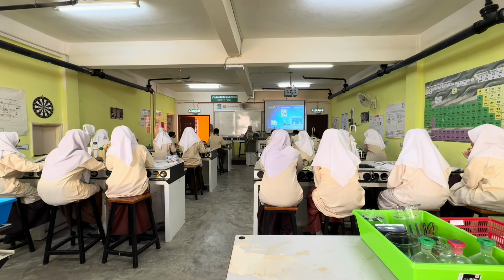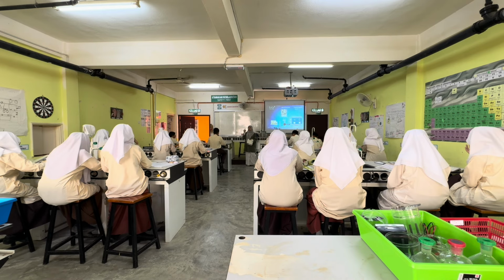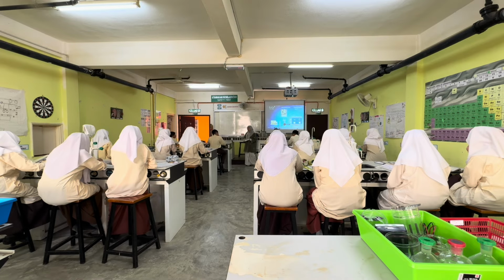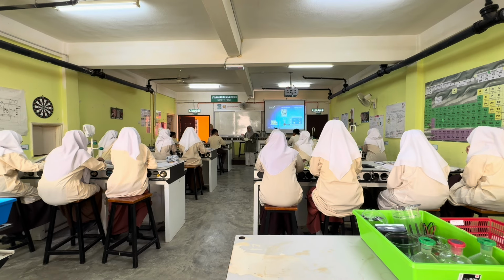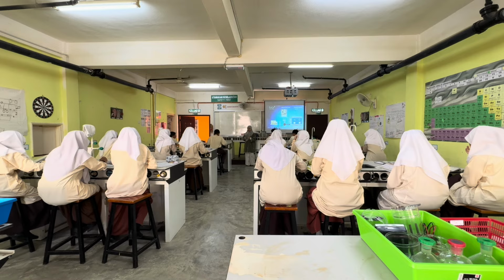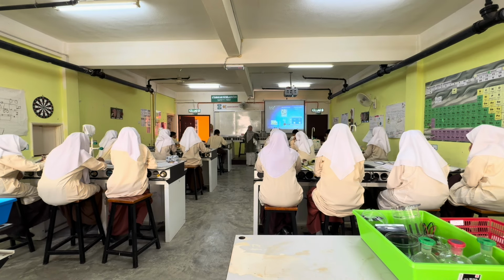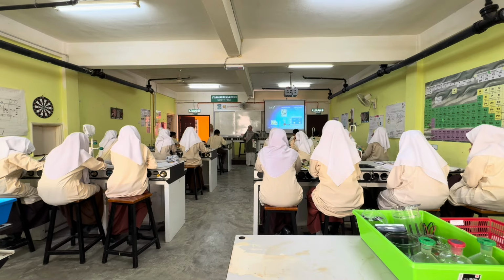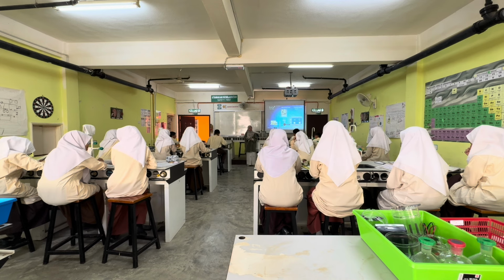Try to see the procedure number 3. The mean in which figure the sugar dissolved faster. So you have to record the time. The observations. Okay? Which one is dissolved first? Which one you can see the salt disappear first. Okay? And then next, after you finish that, you can continue with the rates of stirring.